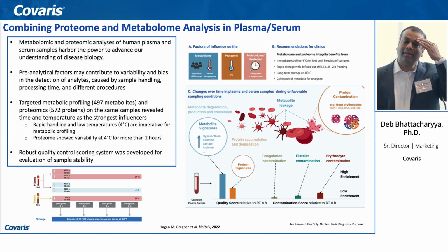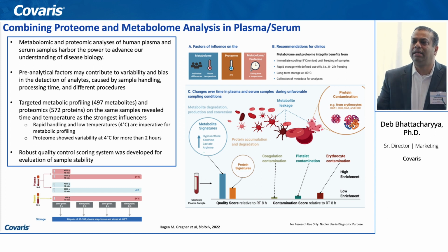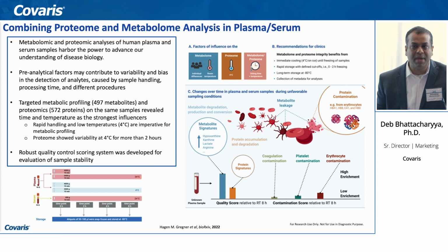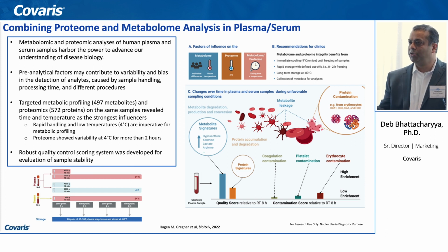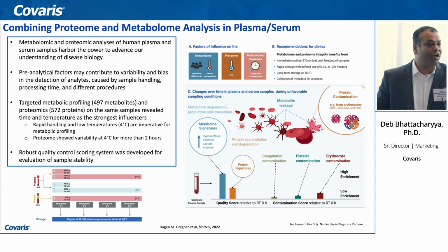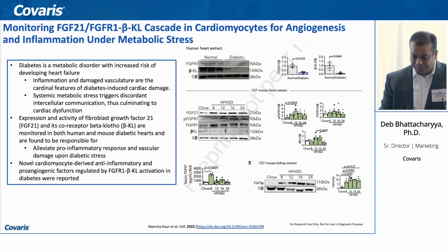And where I think it makes a big difference is where metabolomics can come into play, because this thing is very fast. We are talking about a few seconds to maybe a minute of exposure to this energy that can actually cause a high amount of extraction of proteins, metabolites, DNA, RNA from your samples, and then further processing of those.